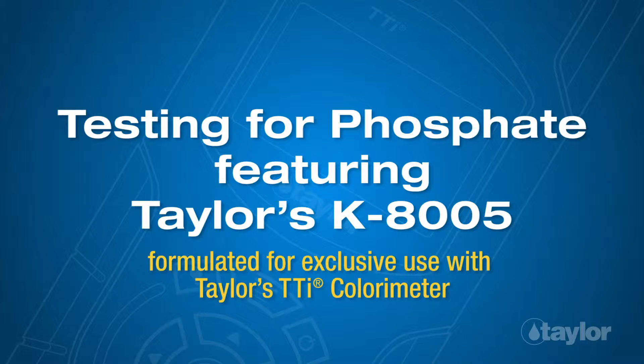Testing for Phosphate, featuring Taylor's K8005, formulated for exclusive use with Taylor's TTI colorimeter.